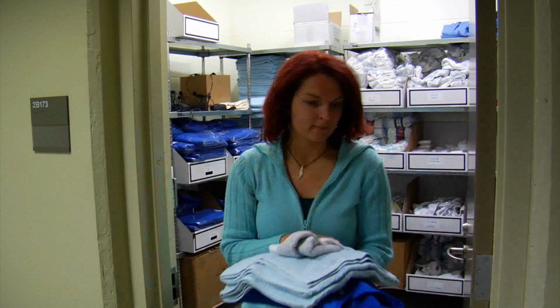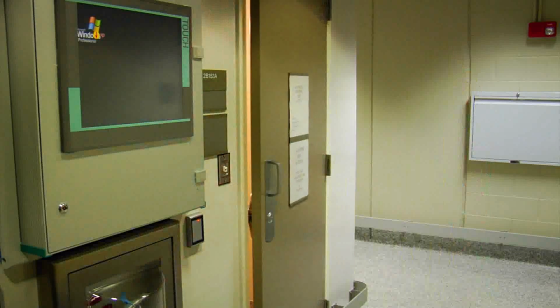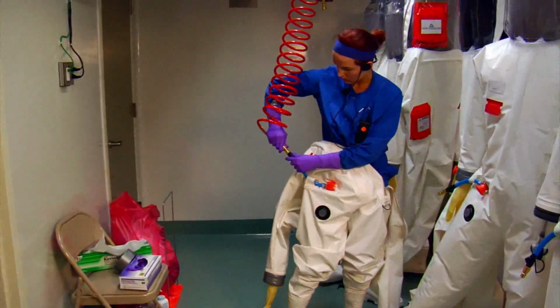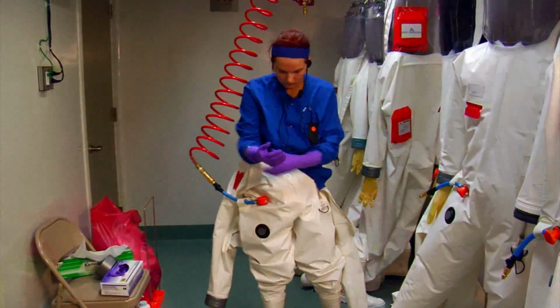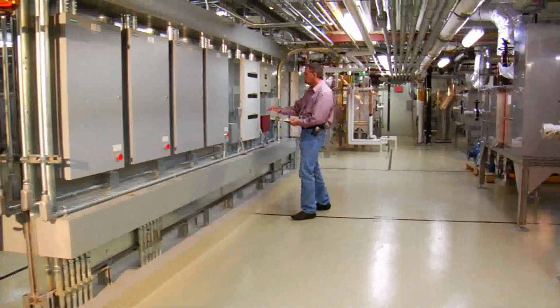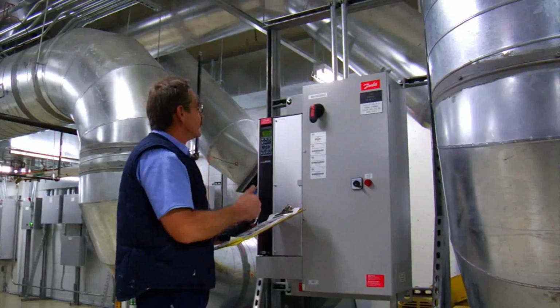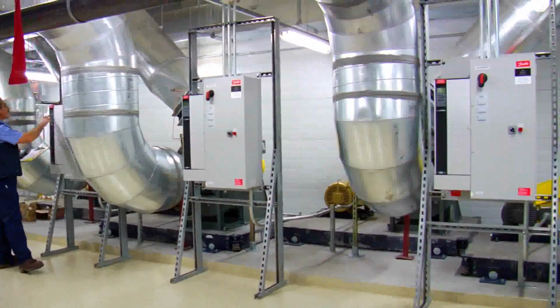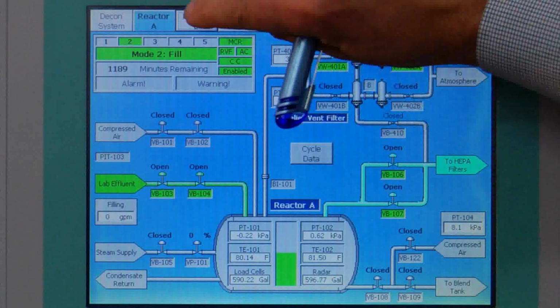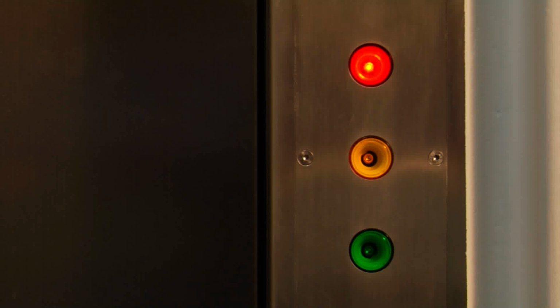In order to fulfill the NIAID research mission, at times scientists working in the IRF will wear special positive pressure suits connected to a dedicated air supply. In this way, the scientists are protected from possible exposure to the microbes they are studying. There also are several redundant, automated systems in place that assure the research is done safely and in a secure environment. Those automated systems include a constant flow of filtered air entering and leaving both the laboratory and the researcher's suit, heat decontaminated solid and liquid waste leaving the building, and layers of security access challenges.